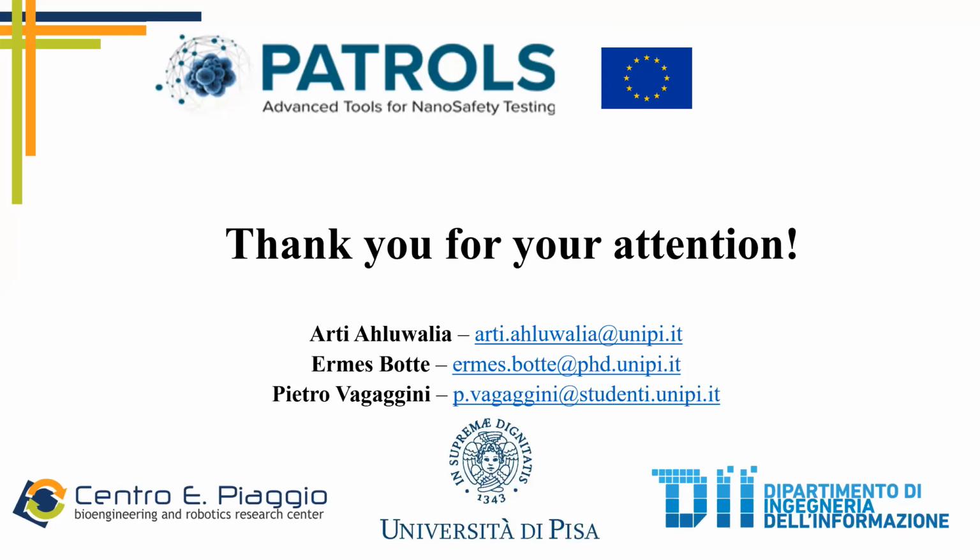Okay, so we're actually at the point where I think we've gone through the demonstration. So what we need to do now is just have a quick question and answer session. So I think really the aim now is for you to start using the system and figuring out what your problems may be, whether you have any queries. So just for this introductory part and showing you how the system works and how you might be able to use it and exploit it for better estimating the effective dose in your experiments.